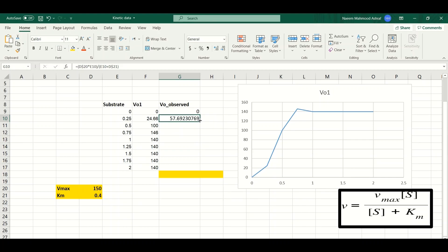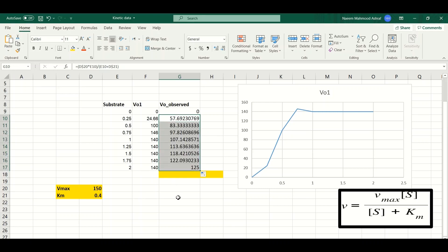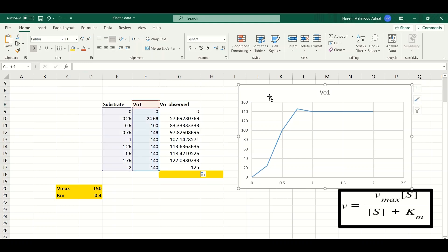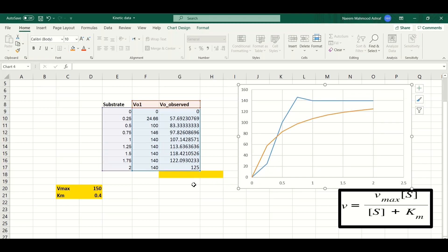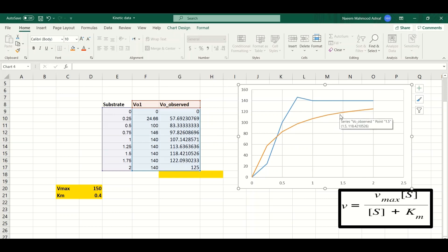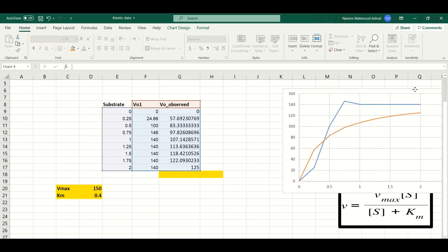This small amendment allows us to drag the formula downward so all observed v-naught values are calculated automatically. Now we have three variables: substrate concentration, experimental v-naught, and observed v-naught. If we click on the chart and include the observed v-naught data by dragging it in, we observe a change in the chart — a nice curve appears. The blue line indicates experimental v-naught and the orange line indicates observed v-naught, and there is a noticeable difference between them.